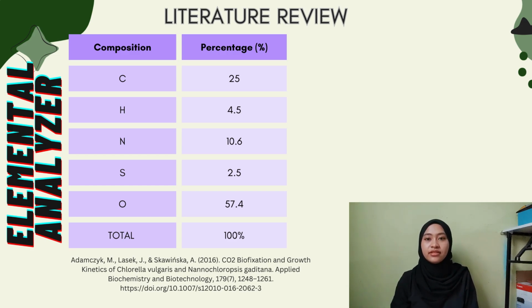Next, the elemental analyzer result shows the composition of carbon, nitrogen, sulfur, and oxygen. The value of the elemental analyzer is stated in the literature.